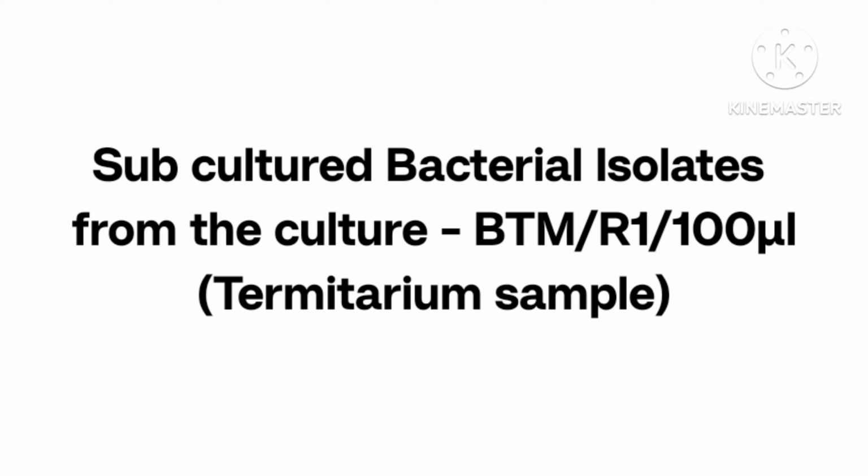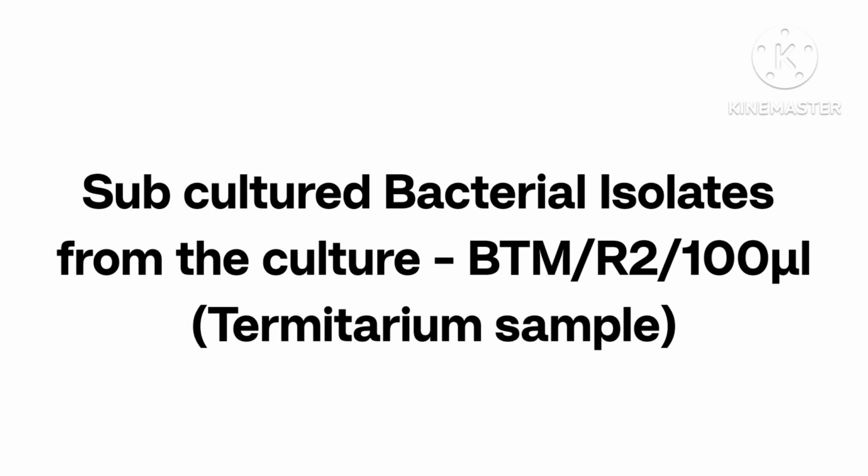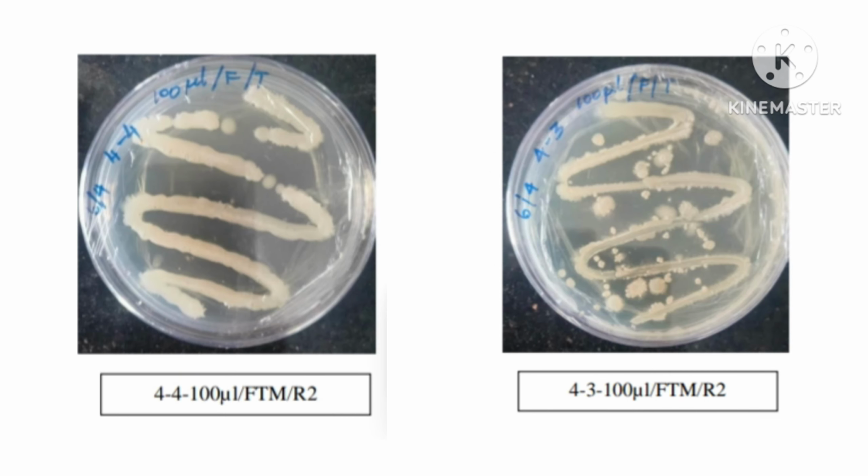Subcultured bacterial isolates from termitarium sample. Subcultured bacterial isolates from replication 1 under 100 microliter dilution. Subcultured bacterial isolates from termitarium sample. Subcultured bacterial isolates from replication 2 under 100 microliter dilution.